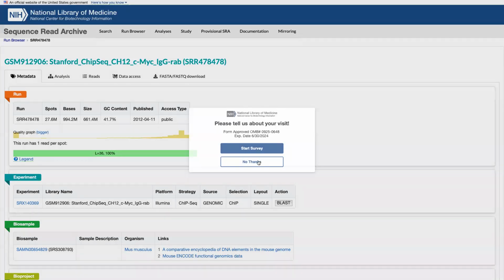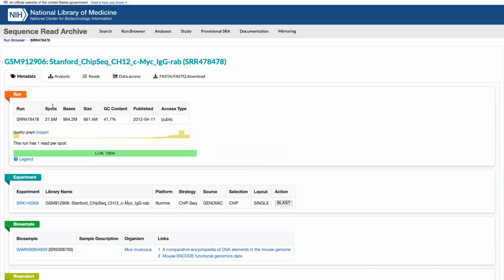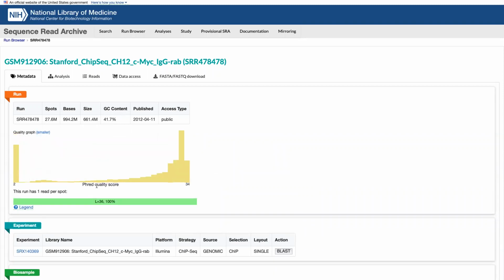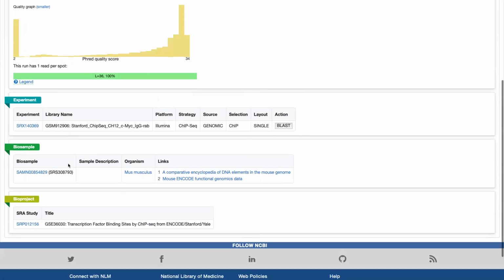You can already see something here. We'll come back to this in more detail. Those quality scores I showed you, those Phred quality scores, they're actually displayed here, like an overall graph of it. You see most of the read quality is up here, but there are some reads which are bad. So we would use those Phred quality scores to cut out maybe this bottom set. Over here, they're showing the whole distribution of the quality of their data. So this gives me some information.